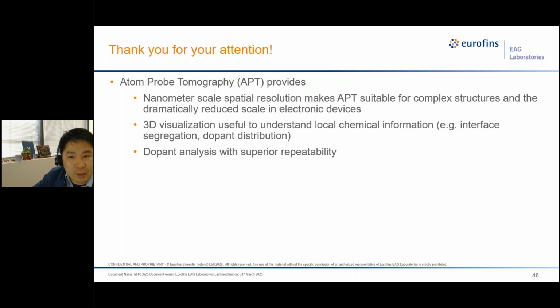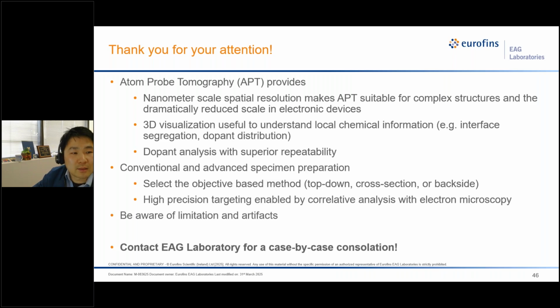So thank you for your attention, and this will be the last slide of my presentation. We provided an introduction to the working principle of Atom Probe, and we showed that we can do advanced sample preparation using STEM correlated analysis. There are also some limitations with the technique that you need to be aware of. For any questions or inquiries, please feel free to contact us for a detailed discussion.